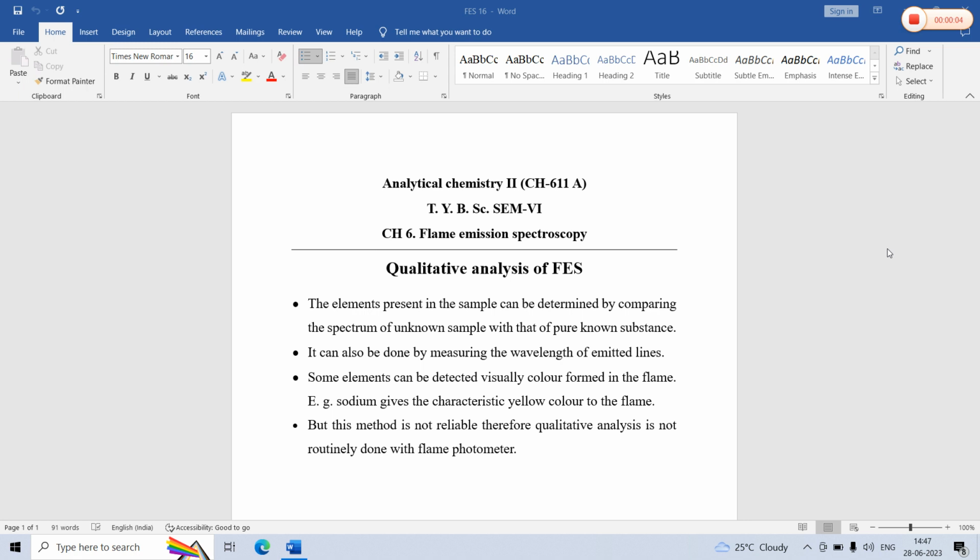Good morning everyone. This is a series of lectures for T.Y.B.Sc Analytical Chemistry semester 6 students, and the course subject is CH611A. The chapter we are going to study is chapter number 6, flame emission spectroscopy. In the previous lecture we have already learned about the principle and introduction part of flame emission spectroscopy.